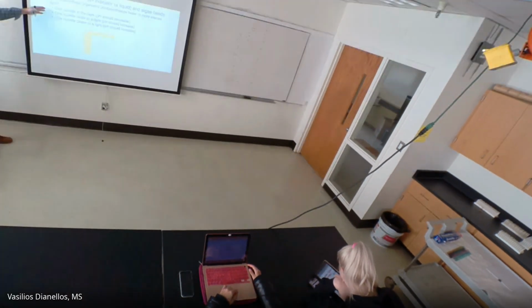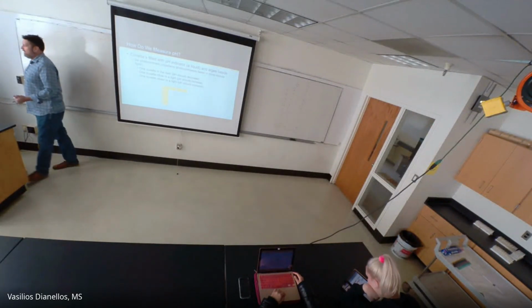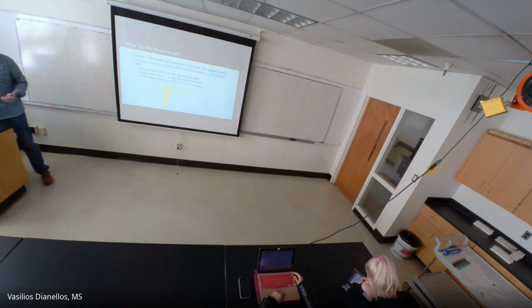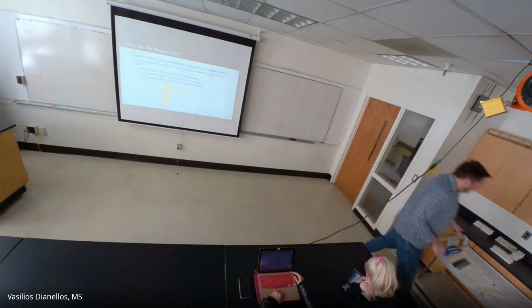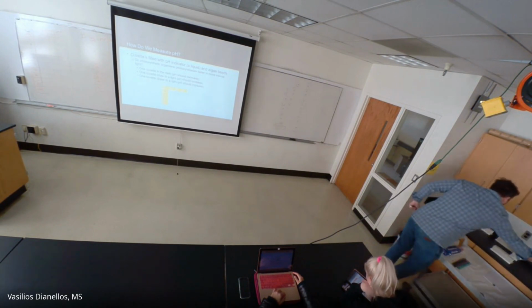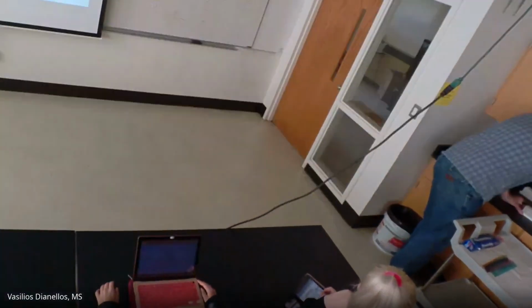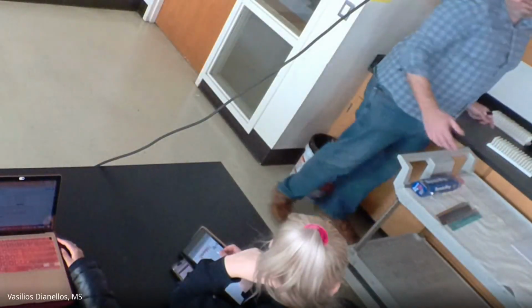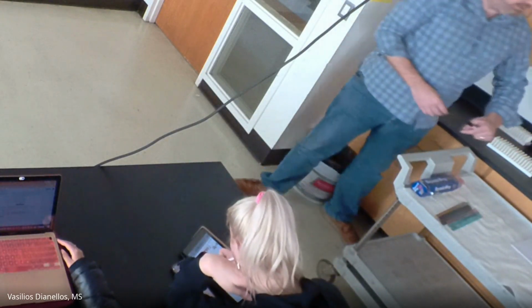So you're going to have one in the dark. You're going to have one close to a light. And you're going to have one even closer to the light. And we might even have an additional one. The point is we're going to have a bunch of them. We'll have a light on. We'll assume it was a white light. And we'll just have a bunch of them. Like one's going to be really close. One's going to be a little bit farther away. One's going to be really far away, depending on how many we get. We might get extra, in which case we'll just do a bunch extra. But at least we'll have 3.